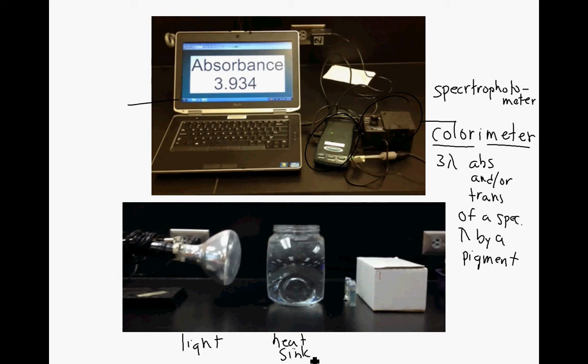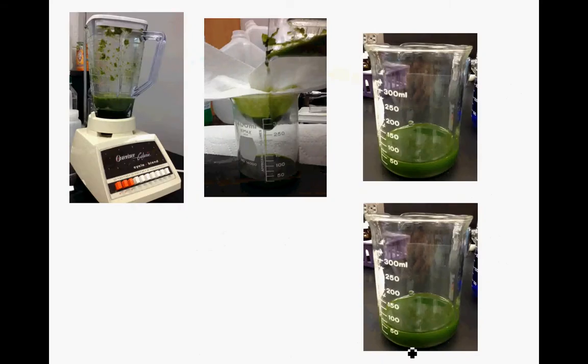The heat sink is just a little aquarium that is filled with water. Then these are our cuvettes, or our samples. These are the two steps that we have here. Let's talk first about what is going to go into the cuvette.